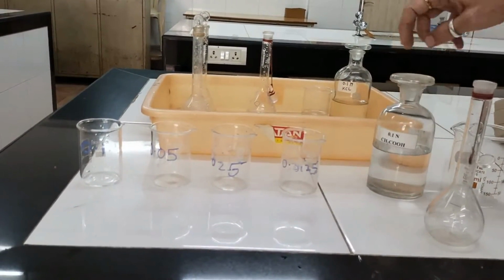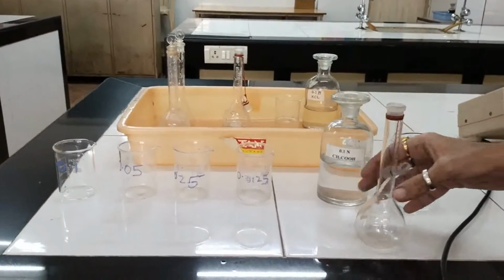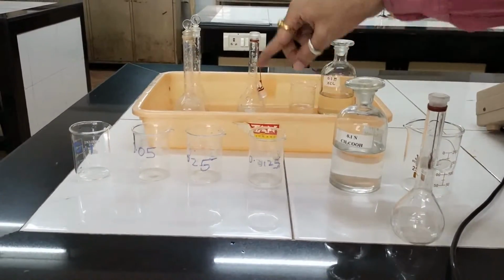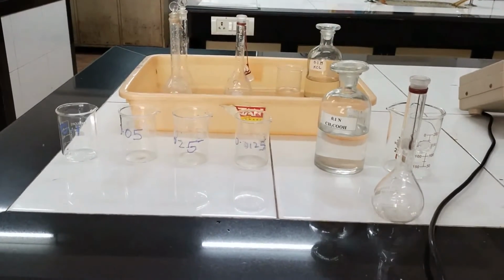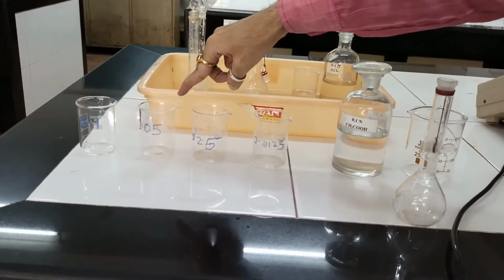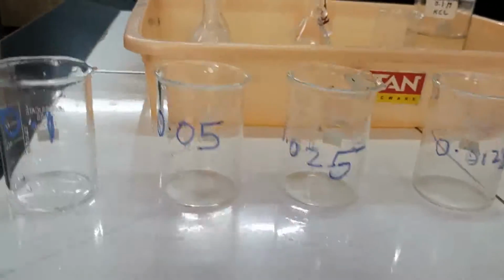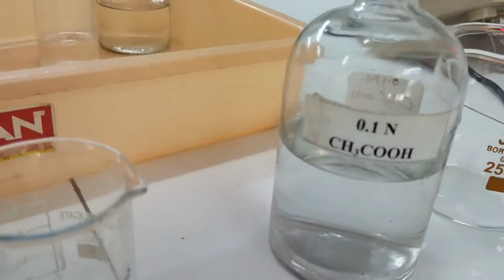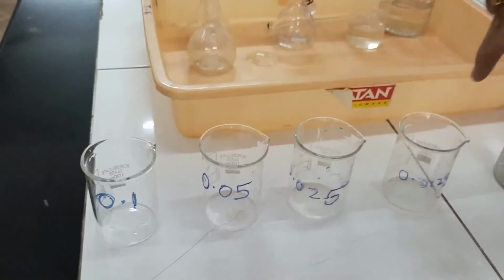We have 0.1 normal acetic acid whose dissociation constant has to be determined. It's a weak acid, and you know Ostwald's dilution law is applicable only for weak acids. Now I have taken 4 beakers and labeled them so that there is no chance of mixing of the solutions. So we have 0.1, 0.05, 0.025 and 0.0125. These are the various concentrations. The given concentration, as you can see, is 0.1 normal acetic acid, so from it we have to prepare these 3 solutions.